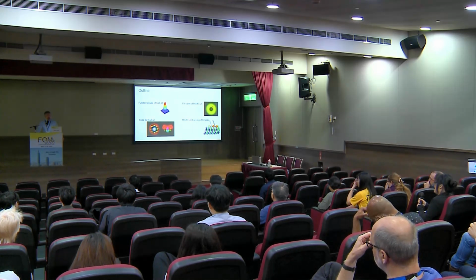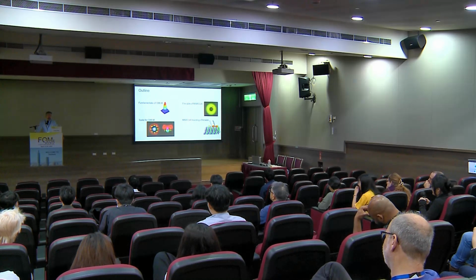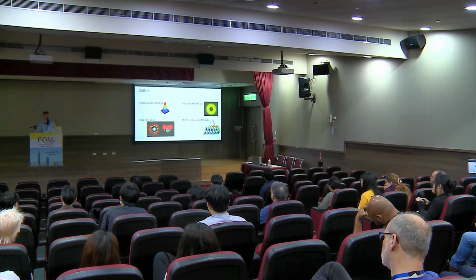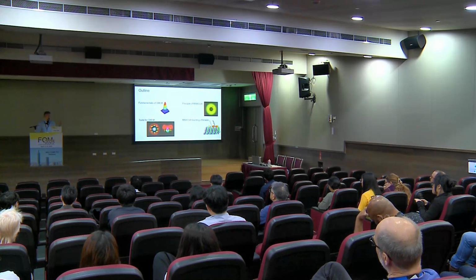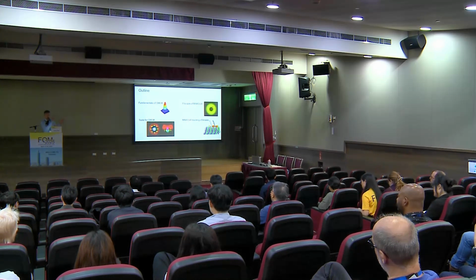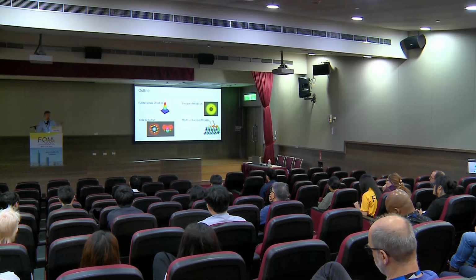So I have not used the Imaris system. I think it's expensive, so I bet it better be good. And in the end, fitting is, yeah, everybody uses the same. Either one uses Gaussian models that don't quite get the resolution and precision that you will get with the experimental point spread functions. If you have a model mismatch, for instance a Gaussian function or a wrongly calibrated point spread function, usually you still get an okay precision, but you get an error, especially in Z. So you get the squeezing, as I showed you with the nuclear pores and the IPSF. So it's something to watch out for. If the same algorithm is used, that's maximum likelihood estimation with an experimental point spread function, then they should all kind of perform the same.